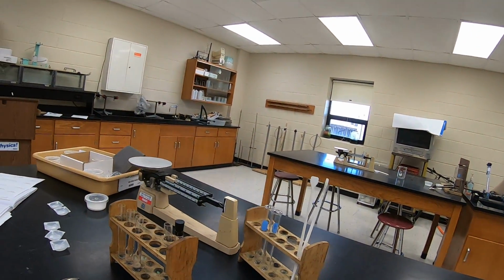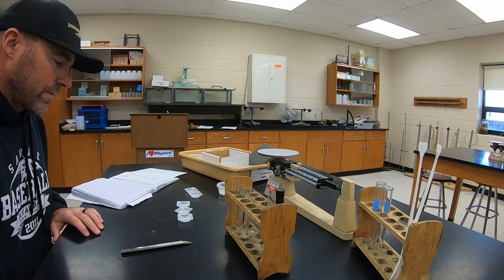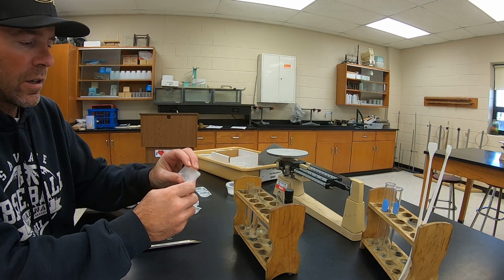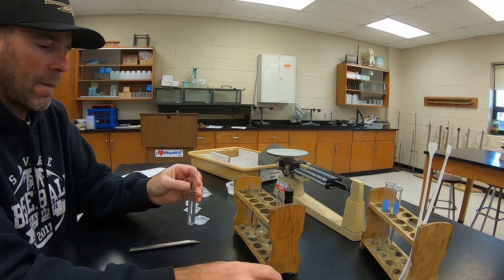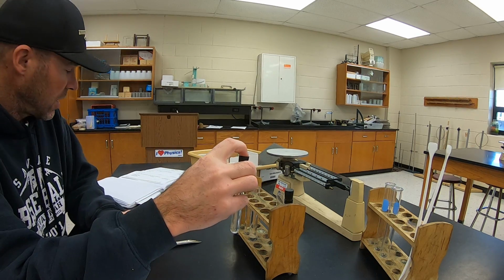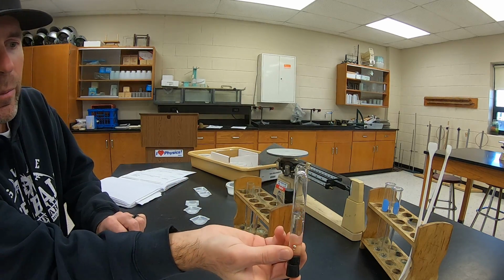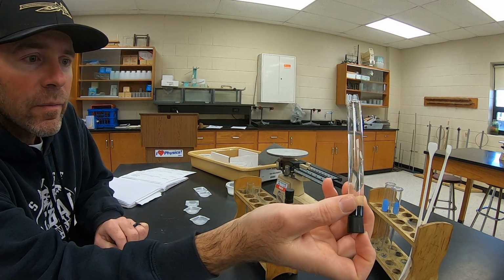Let's start out with the rock salt first. I'm going to pour it in here, put the lid on, and see how many inversions it takes, just like we've done before. If it takes more than 25, we're not going to count them. We're just going to stop at 25. So that's 1. You can see there's salt still on the bottom. There's 2. Still salt on the bottom.